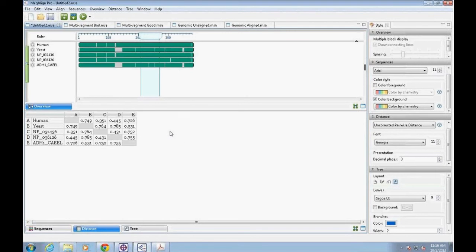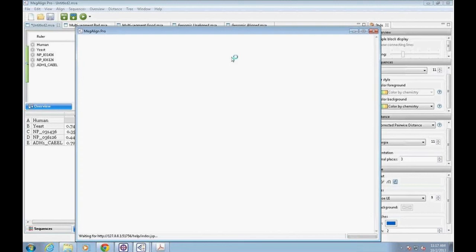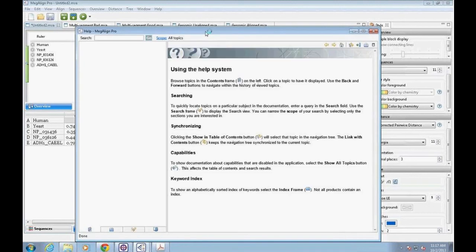And there are very useful resources within the DNASTAR help for assistance in interpreting this information for the specific metric you chose. And again, in response to the question, there would be some information located within the DNASTAR help, which gives some more specifics on these different alignment methods that you could read through to make the decision for your particular project. But there are a couple ways, since we're talking about the help, that you can access it. One is the help that's embedded within the DNASTAR programs itself, which I am opening up right here.